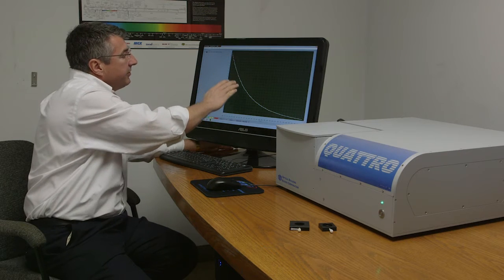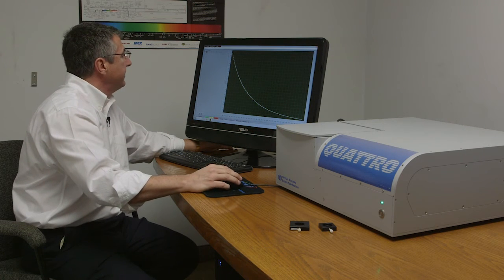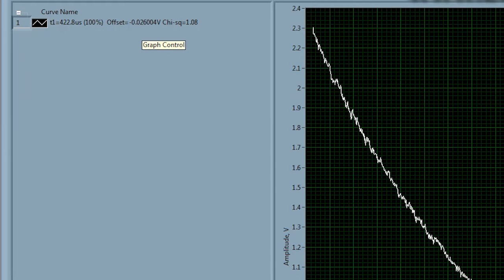In only one second we got a very good looking decay that here is measured and immediately as it collects data it also reports at the very top a measured fluorescence lifetime. In this case 422 microseconds with a chi-squared which is a goodness of fit measurement of just a little over one. So it's a very good fit.